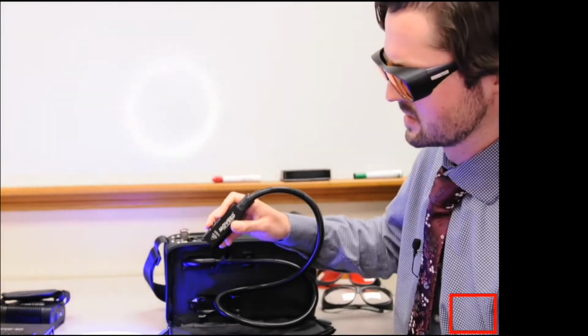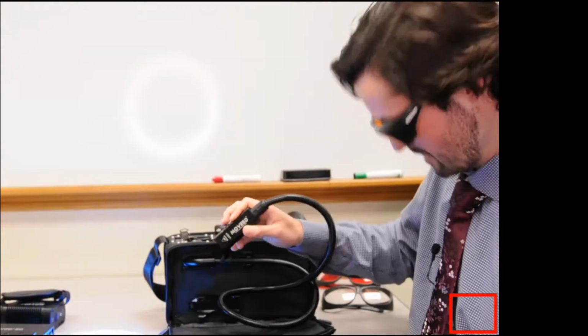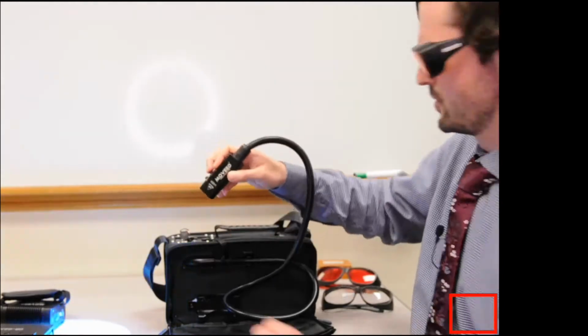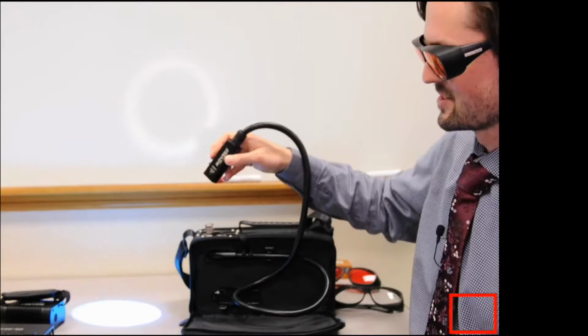And then if we click select again and we click up, we're now going to be working with that cyan wavelength of light, or that medium excitation. I don't know how you guys can see that, so maybe I'll move it right here. There you go. So then this is our cyan excitation.